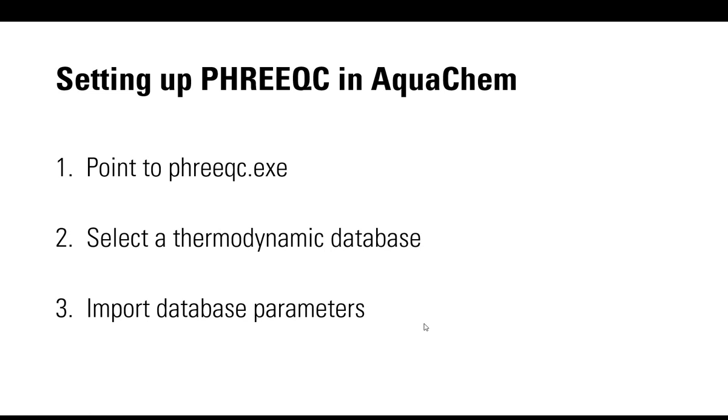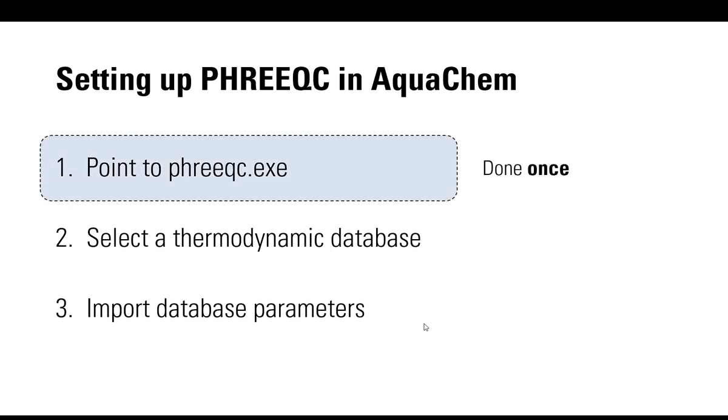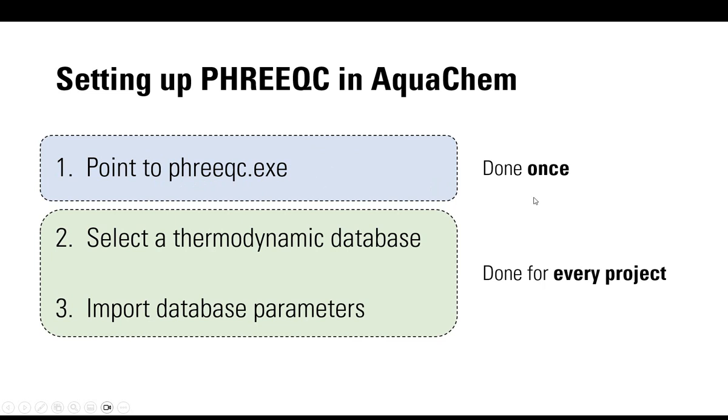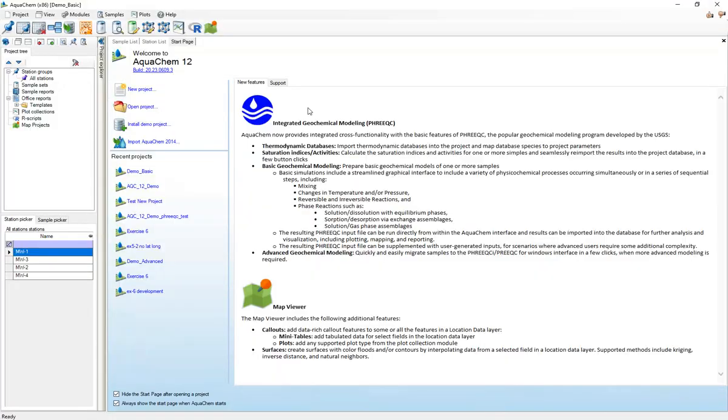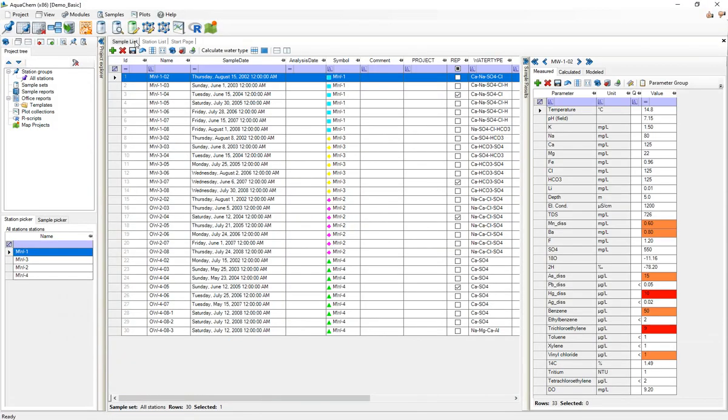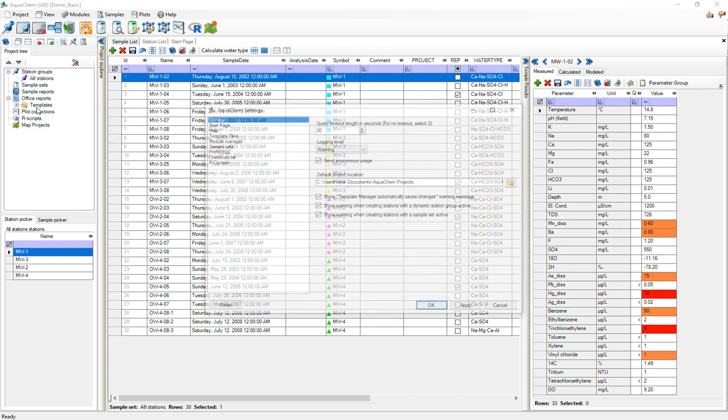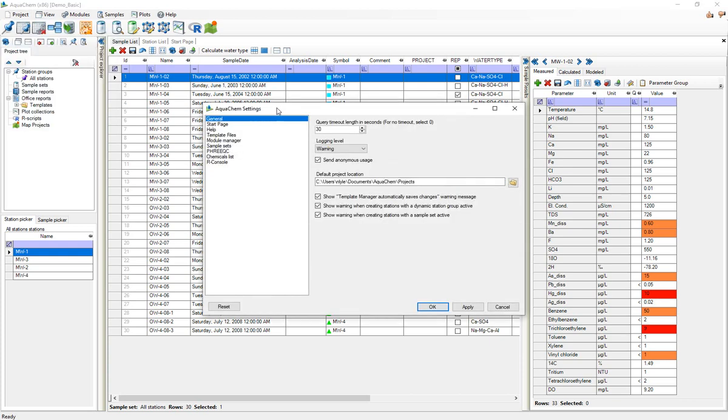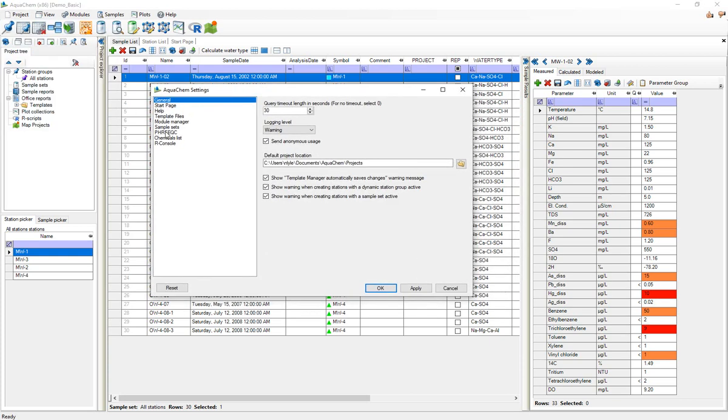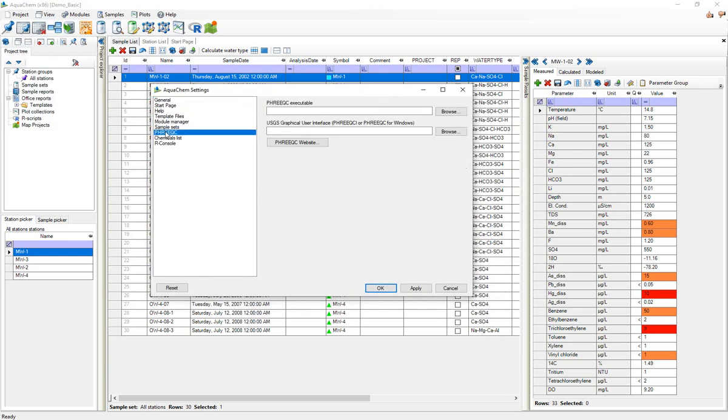This first step is done once for installation of AquaChem whereas these last two steps are done on every project. So I'll get AquaChem open and get started on the first step which is pointing AquaChem to PHREEQC.exe. To do that I'll press this project button here in the upper left and find the AquaChem settings, the program wide settings, and I'll find PHREEQC.